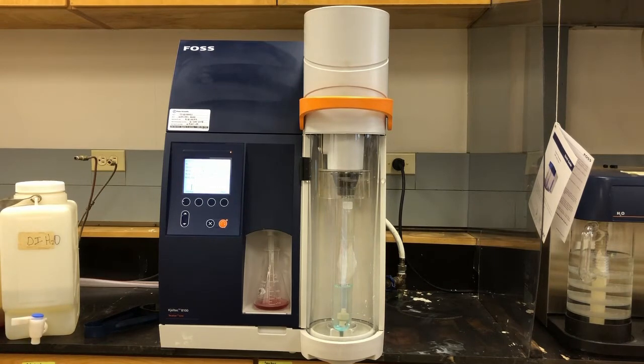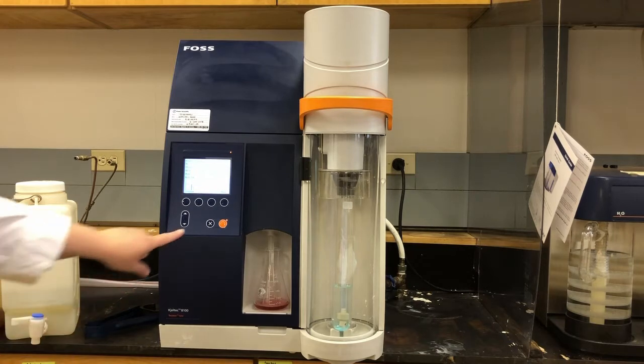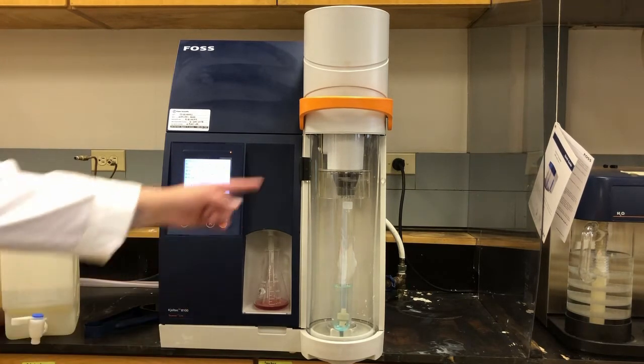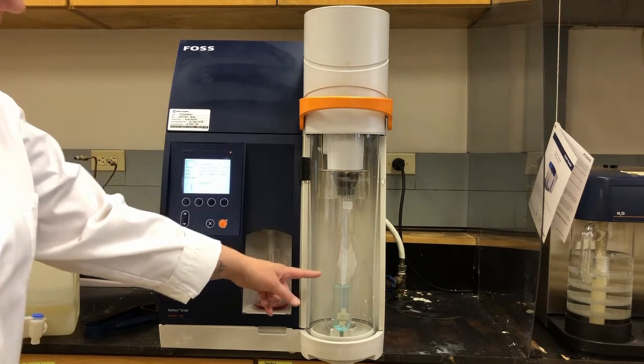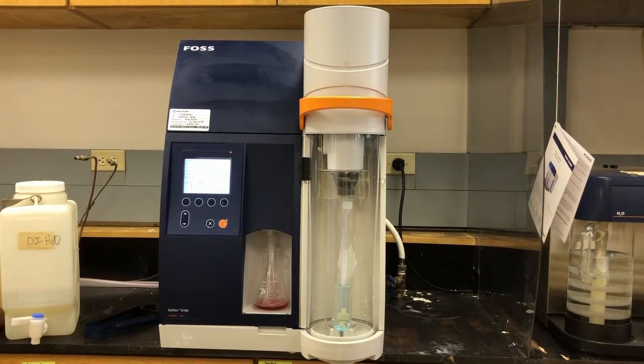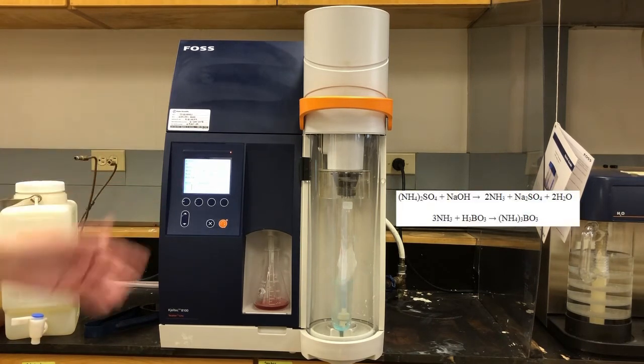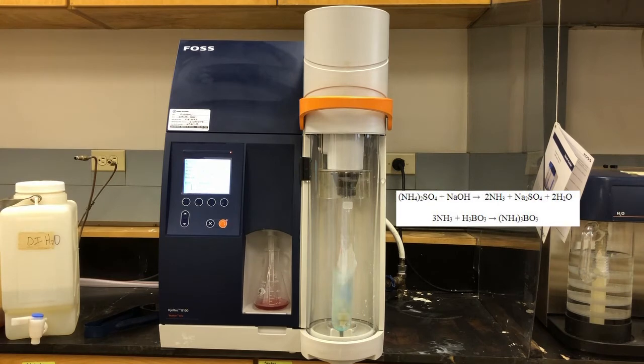Once we have our sample and our receiving flask in, we can press start. And you should see fairly soon now the alkali being dispensed into the tube. The alkali in this case is sodium hydroxide. There you go, so that's dispensed in the tube. And you can see that's a fairly vigorous reaction because it's a concentrated base reacting with a concentrated acid. Remember the sulfuric acid that's in our tube.